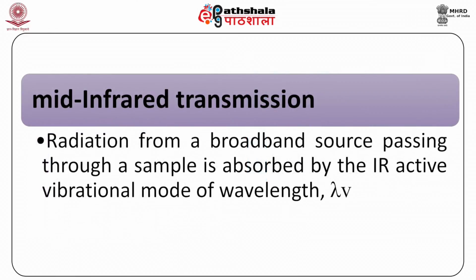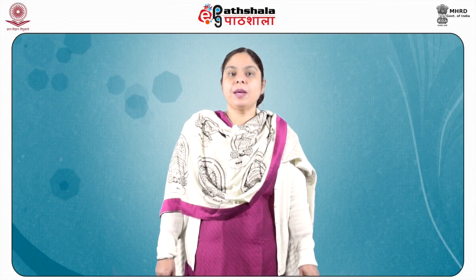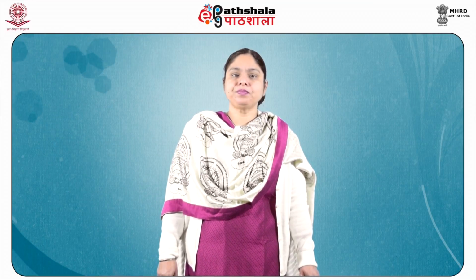Now, in the mid-infrared transmission setup, the radiation from a broadband source passing through a sample is absorbed by the infrared active vibrational mode of wavelength lambda. Both mid-infrared and Raman spectroscopy are commonly used in microscopy-based configurations in which the vibrational spectrometer is interfaced with an optical microscopy system, which enables both visual and spectroscopic examination.